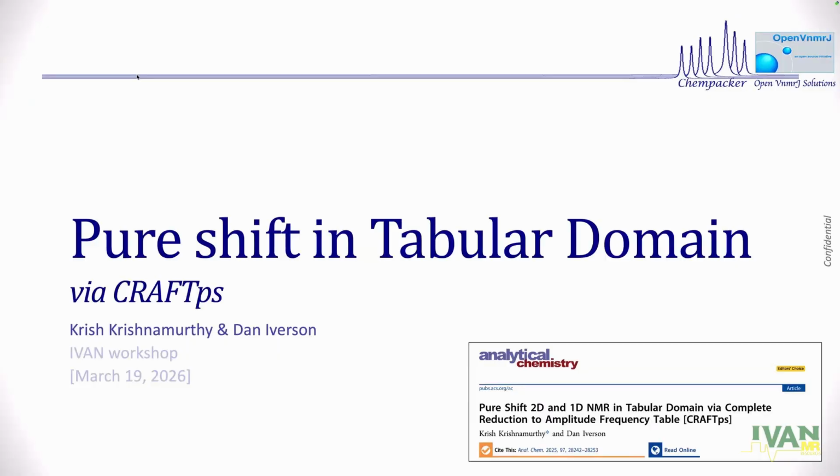So let's get going. I'm going to first share my screen. Hold on for a minute, if you can. Okay, share my screen, and then I'm going to put this in full. Okay, so I'm assuming that you can see my PowerPoint.